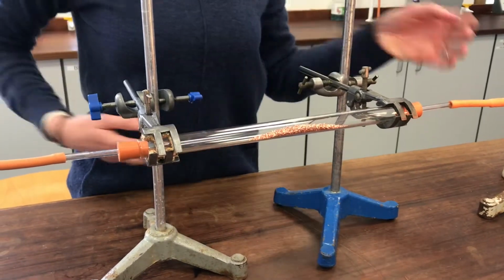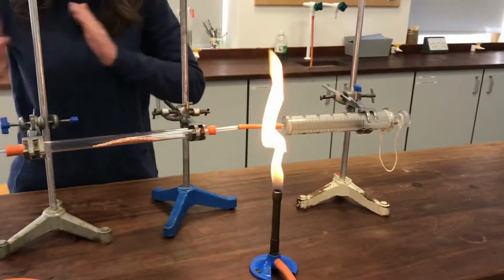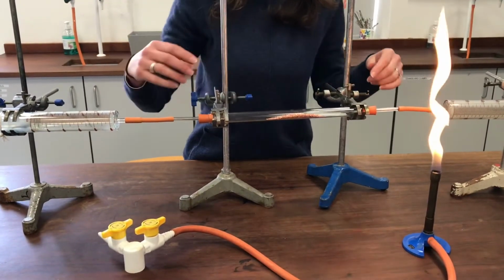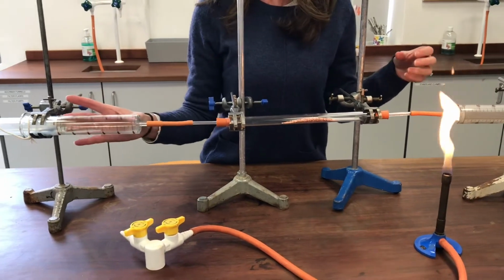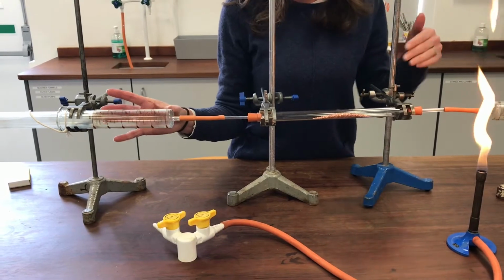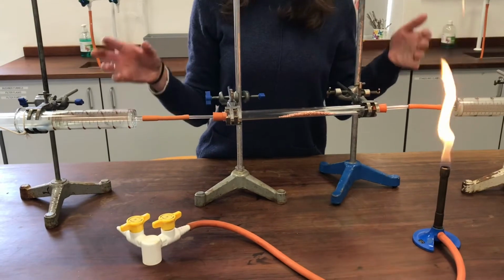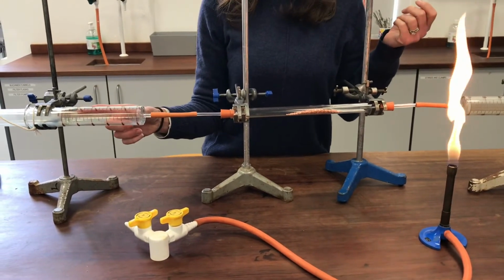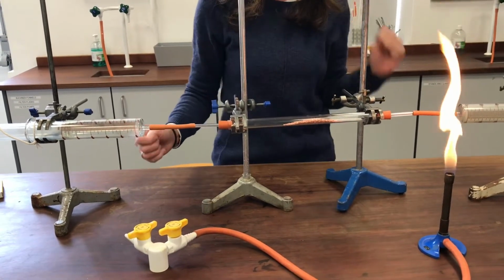And what I'm going to do is to use these gas syringes either side to help shuffle gas over the air that's in the mixture, over this copper as I'm heating it, this hot copper. And what we'll do is take a reading at the start about the volume of gas that we've got in our gas syringe, heat this up, allow it to react with oxygen in the air, and then we'll allow the whole system to cool down again and take a final reading, a final volume. And from those two pieces of data, we should be able to calculate the percentage of oxygen in air.